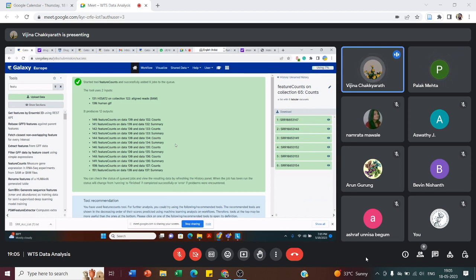For genome expression analysis, we are using DESeq. Other tools are limma and edgeR, and both are good for RNA analysis. Limma was used before for microarray analysis, but nowadays it has been extended to RNA-seq analysis also. EdgeR and DESeq are almost the same and give almost the same result. But right now I'm using DESeq.